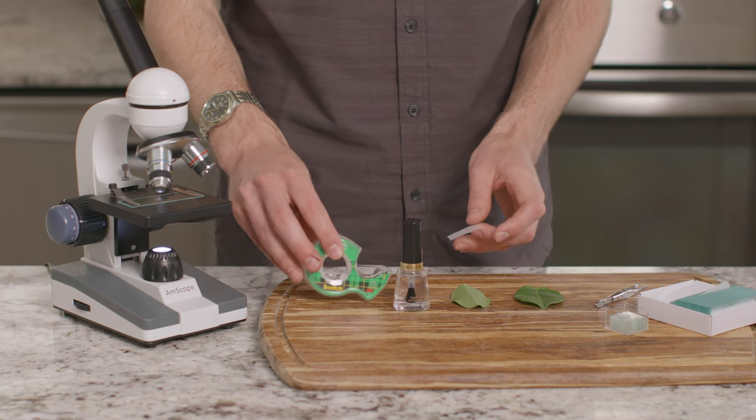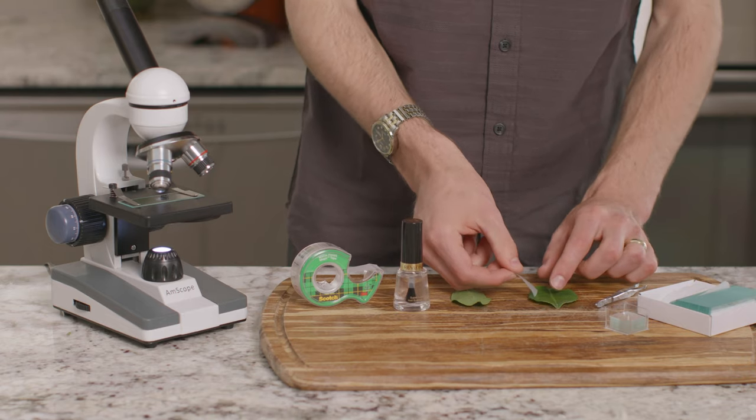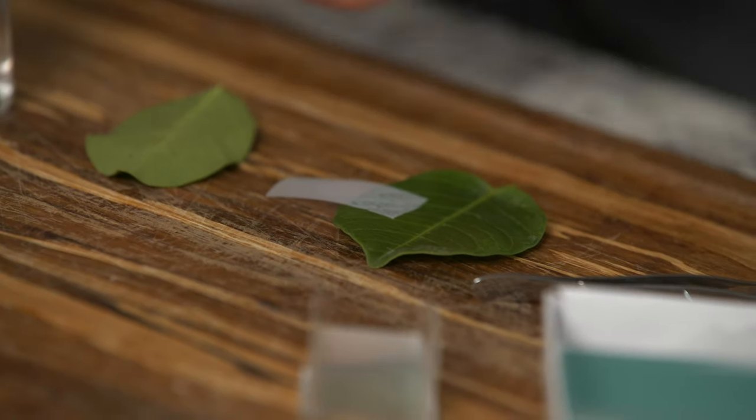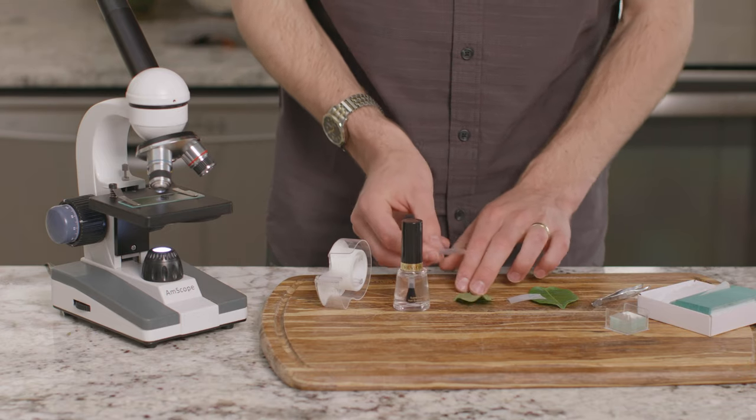First, we'll prepare the leaf by placing a piece of clear tape on the top of the leaf, with half of the tape hanging off the leaf. Now we'll do the same thing on the bottom side of the leaf.